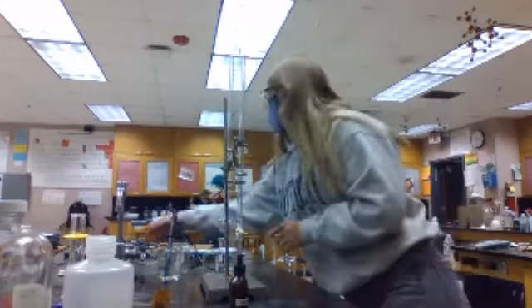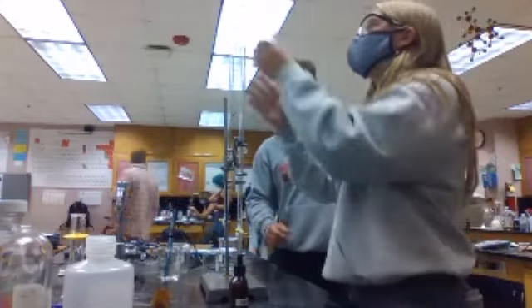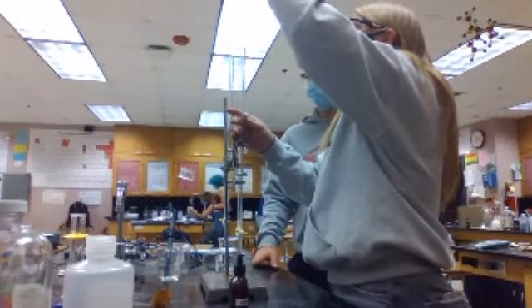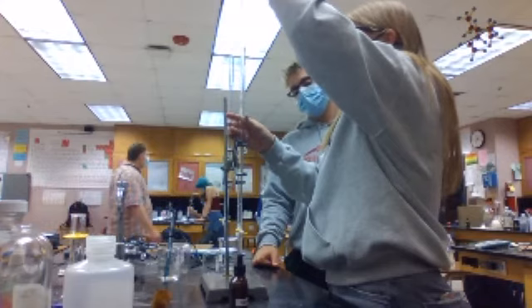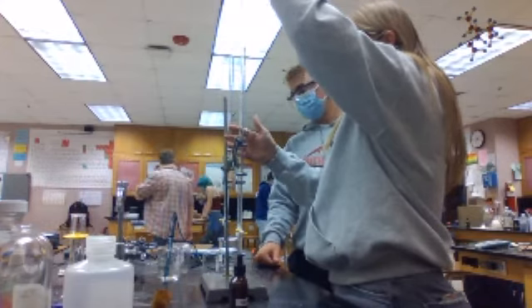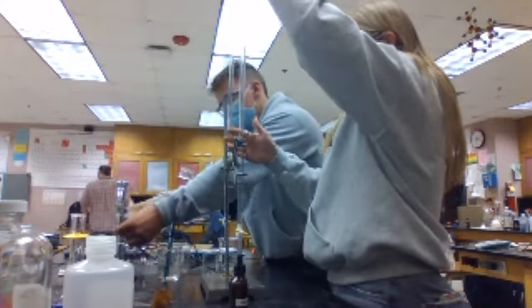It's a first trial, right? It's a rough estimate for the first trial, that's fine. For the other two, for our first one we got 9, the first one we got 11. Really good for the base. If it's too far away from your other two, you want to throw that one out as an outlier and just say that you screwed it up, right? Yeah, that's what we're doing.